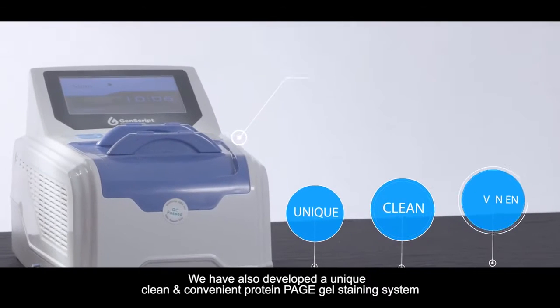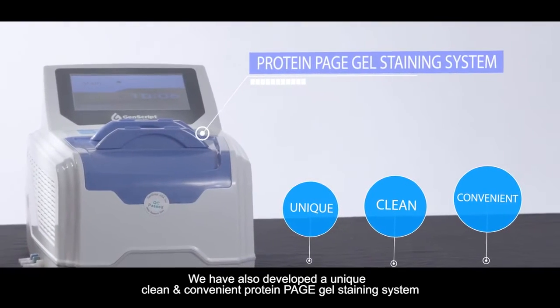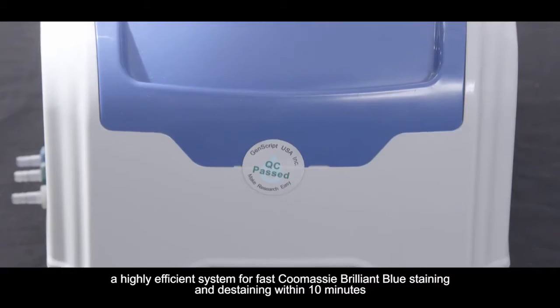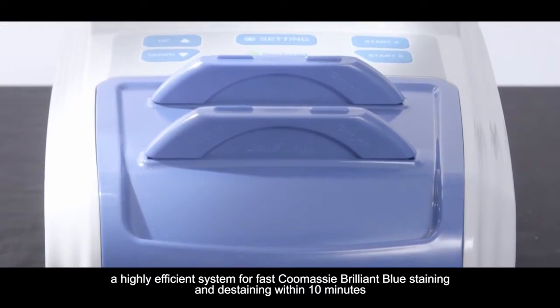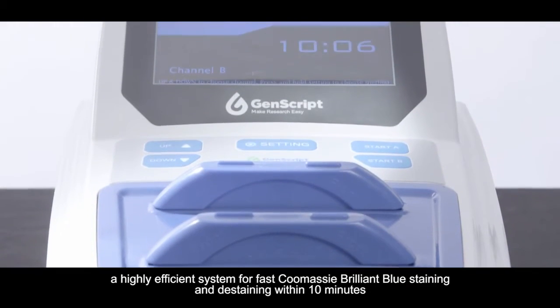We have also developed a unique, clean and convenient protein page gel staining system, a highly efficient system for fast Coomassie Brilliant Blue staining and de-staining within 10 minutes.